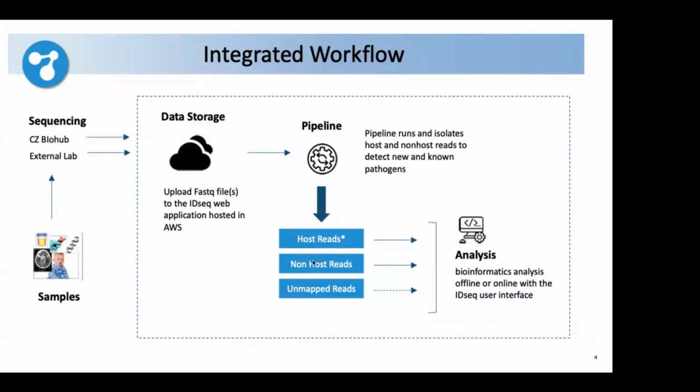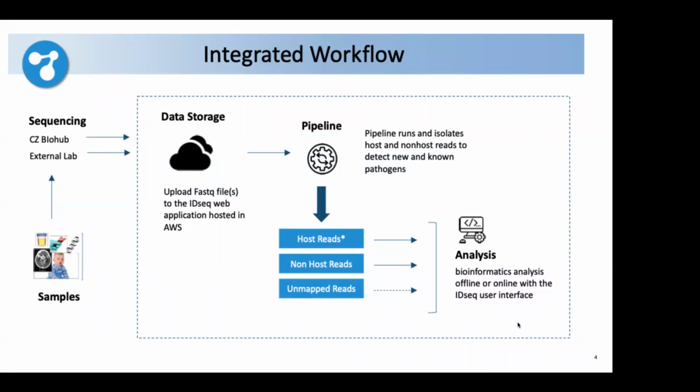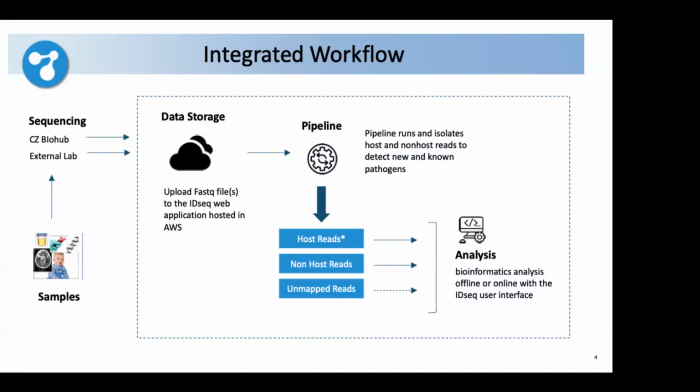This is particularly important, especially from human hosts, because we don't want to hold on to those human reads from a privacy perspective. And that's really not the aim of the tool either. It's to bring to light what those non-host reads are. And then the final step in the pipeline is this analysis. We provide several bioinformatics analysis tools that can happen through our user interface, and I'll go over a couple of those when we jump into the tool.